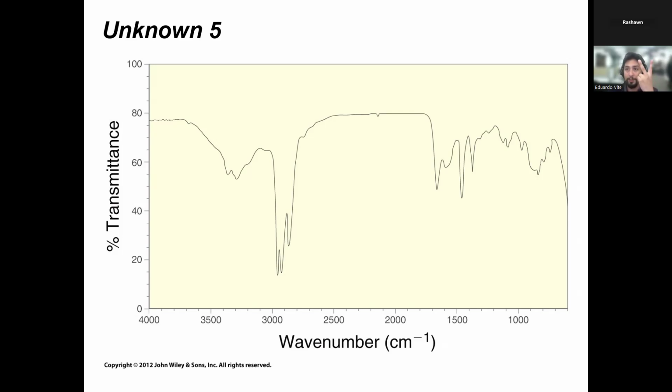There's two peaks, so that means there's only one carbon nitrogen bond, so it is a primary amine, and that is definitely correct. And then if you look at 3000, once again, sp3 stretches, not very useful, but still there. And now that we know there's an amine, the peak at around 1500 is probably going to be a carbon nitrogen stretch. But we can't tell for sure. Honestly, that's not very important. What is important is these two peaks right over here that tell us it is a primary amine. So very good job. You guys are getting much better at this.